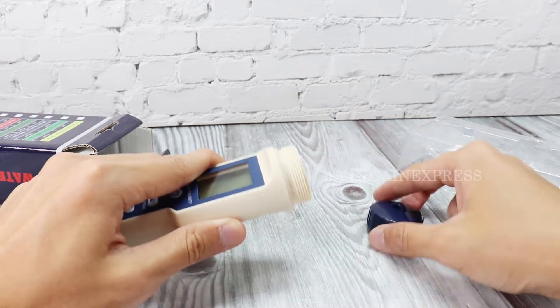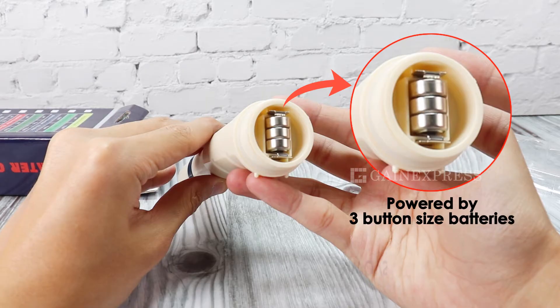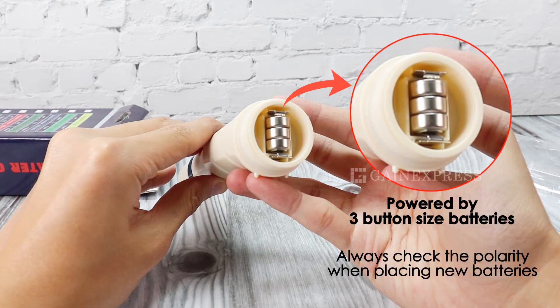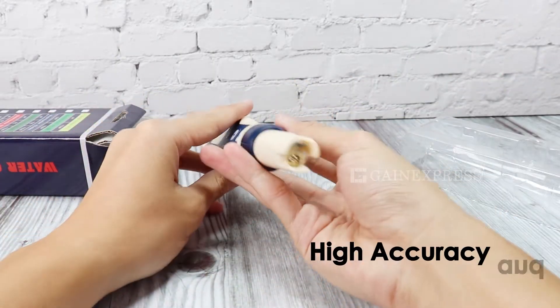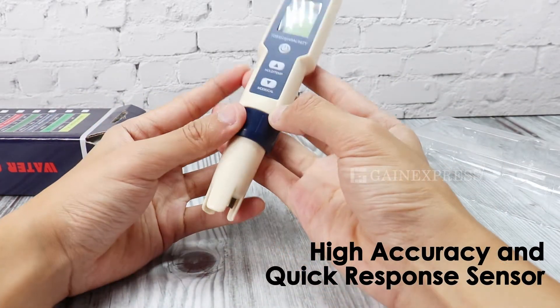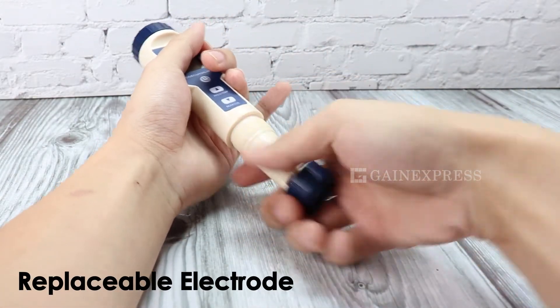It is powered by two button cell batteries. Always check the polarity when placing new batteries. Its sensor is high accuracy and quick response, and the electrode is also replaceable.